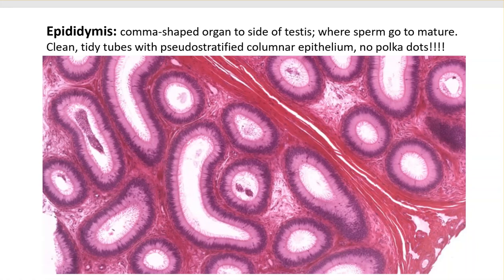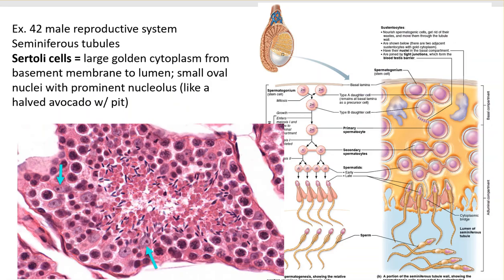We can see that in this slide. So this is the testis, and then this is the epididymis. So this is the epididymis.